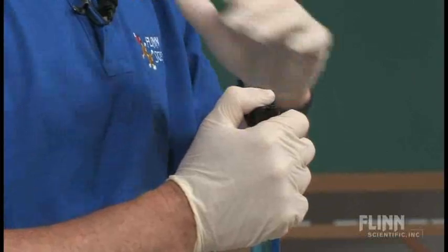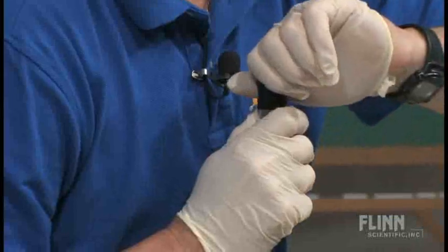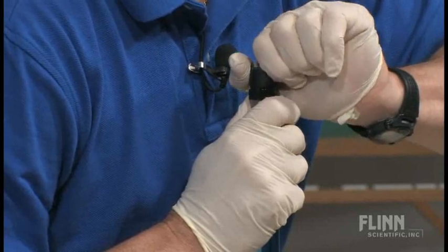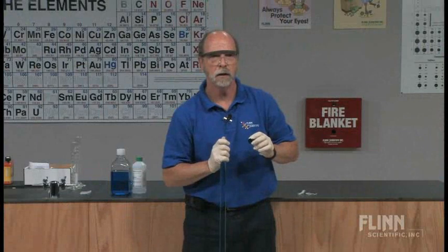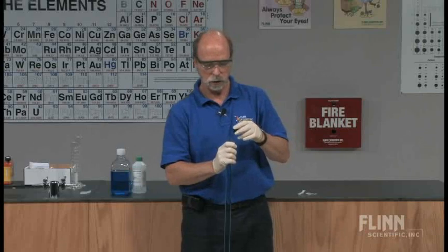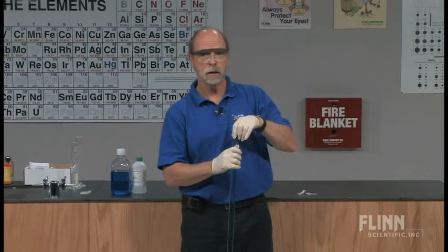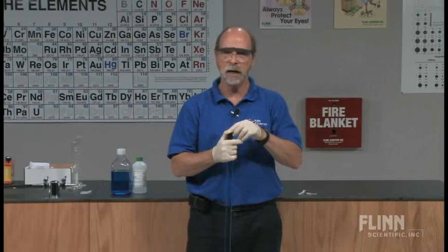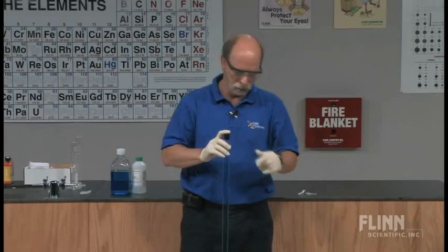I'm going to put this close to my microphone, and perhaps we'll be able to pick up the sound. There was a little sound there. The sound was air rushing in to the partial vacuum that was created when those two liquids formed not a vacuum, but a pressure that was somewhat below that of room pressure.